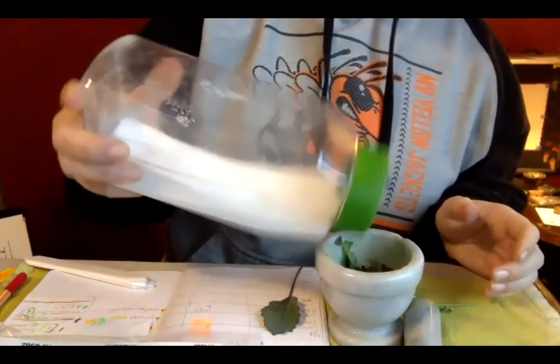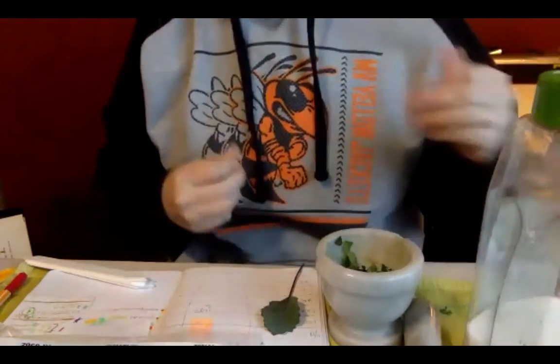Okay. Pinch of salt. And then if we were in the lab, we'd use acetone. You may have acetone in your cupboards. That is nail polish remover. It works really well to help chemically break down the cell wall. You don't need it though. I actually had a little bit, but I couldn't use it because it was purple. The cosmetics industry had colored it, randomly purple to be pretty, I suppose. Because this is a color-based test, I didn't use it.